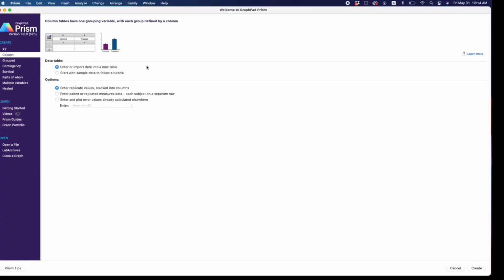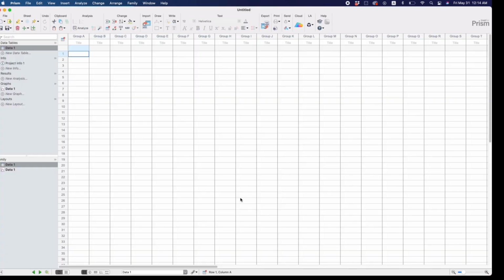Hi, so in this video, I'm going to show you how you can perform unpaired student t-tests using Prism. I'm using version 9.5, and when you open Prism, it provides you on this side a number of options to create a table. For unpaired t-tests, you're going to choose the column option, and you're going to make sure that the option you're choosing is enter replicate values stacked into columns. Once you've made sure, just click on create, and it gives you this table of data one.